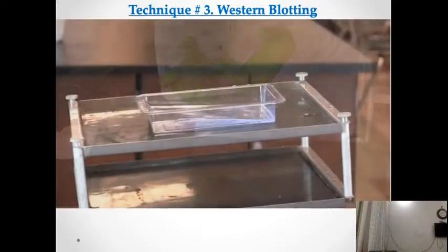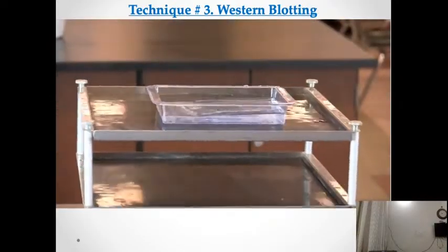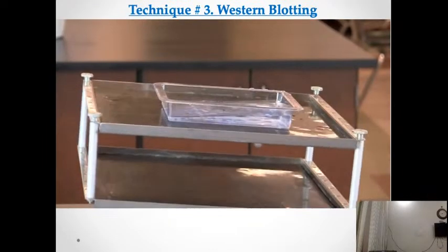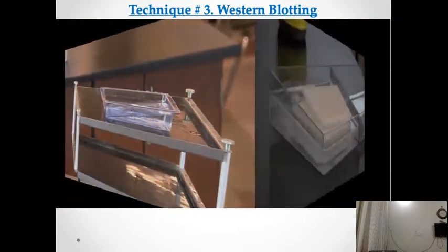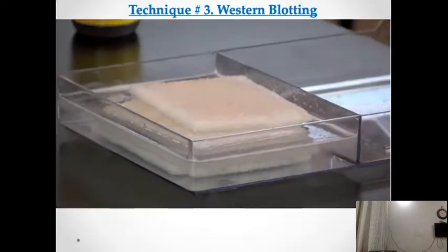After trimming the top and bottom of the gel with a straight edge, equilibrate the gel in the tray with blotting buffer for 15 minutes on a rocking platform. Pre-soak fiber pads in blotting buffer so that they are thoroughly soaked.